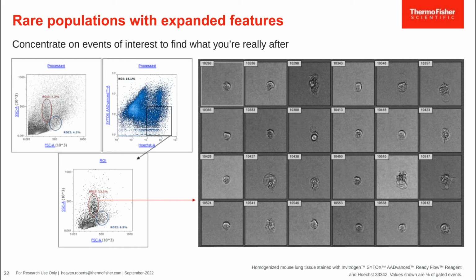But when we look at the images, we can see that while there are cells in these images, many of them are still attached to debris. Some of them have large blebs and other evidence of apoptosis. And we certainly don't want to go through the whole process of, sorry, Annexin V folks, but Annexin V staining adds another level of complexity to sample prep that can be a bit problematic when you're trying to do a lot of titrations on a very small number of cells.